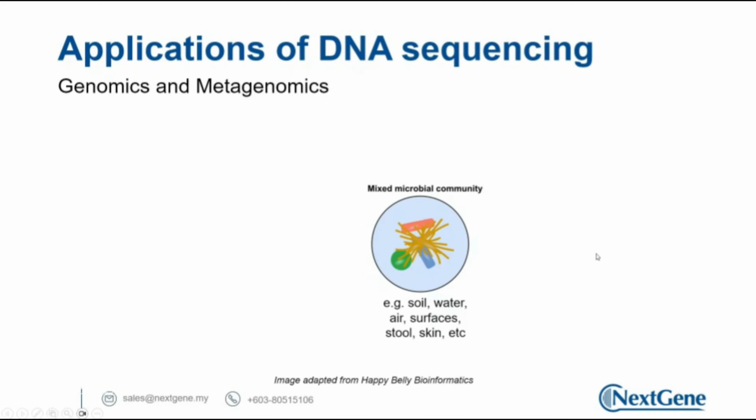So back to our topic today, microbial sequencing or bacteria. I think we will be more focusing on the bacteria for today. Just to rehash a little bit on our samples and how we perform the whole genome sequencing or microbial genome sequencing. We might have samples from different sources, like clinical samples, or samples from soil or water. Normally, these kinds of samples will contain multiple organisms. So it has a mix of maybe fungus and also bacteria, or even virus and maybe some other organisms as well. This is how our sample looks like in most cases.